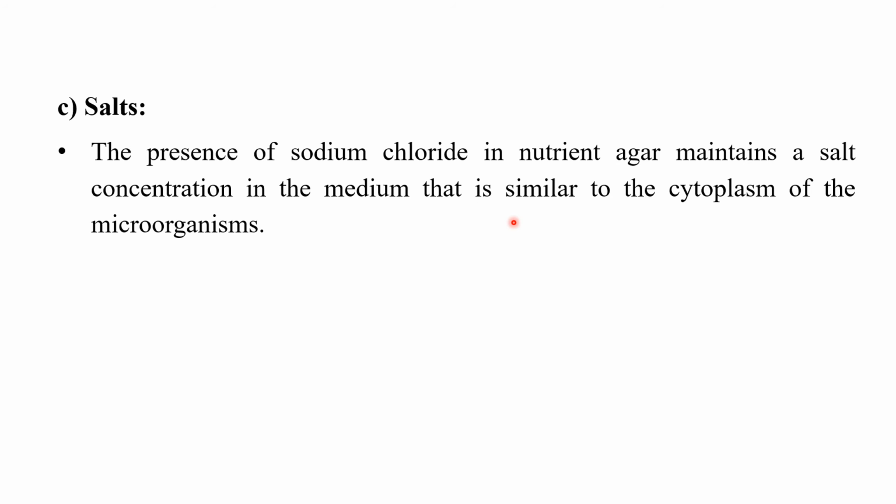The osmolarity or the salt concentration of the medium must be similar to that of the cytoplasm of the microorganism. Therefore, we have to add an appropriate quantity of sodium chloride in the nutrient media so we can maintain the salt concentration.